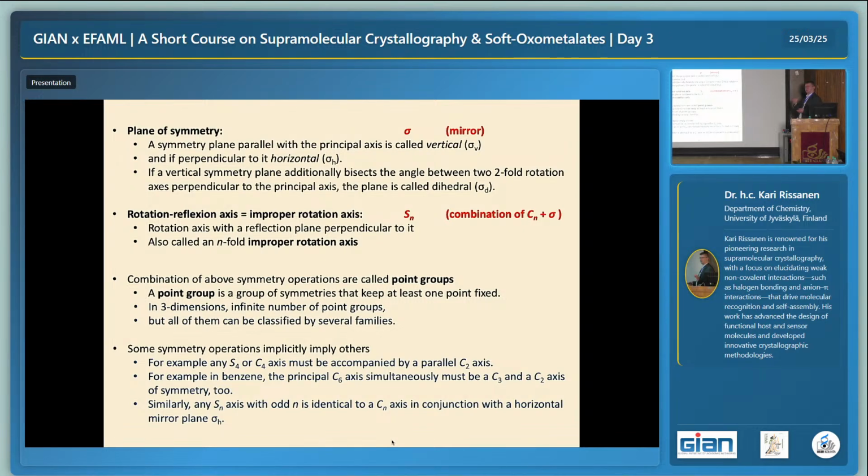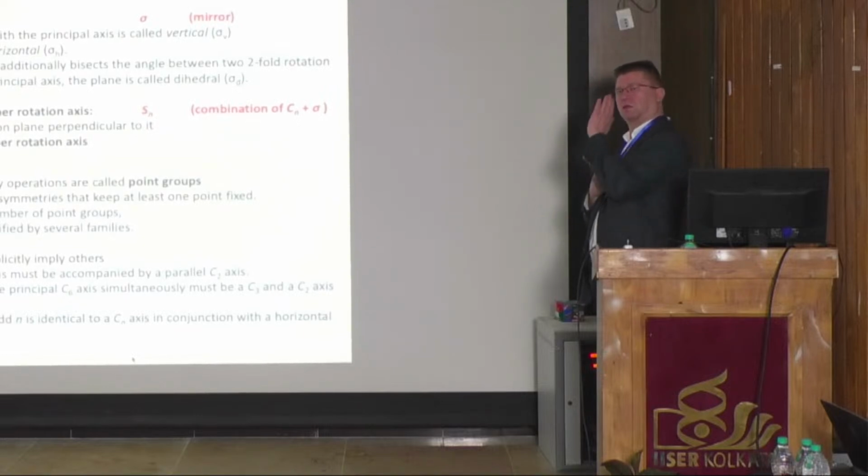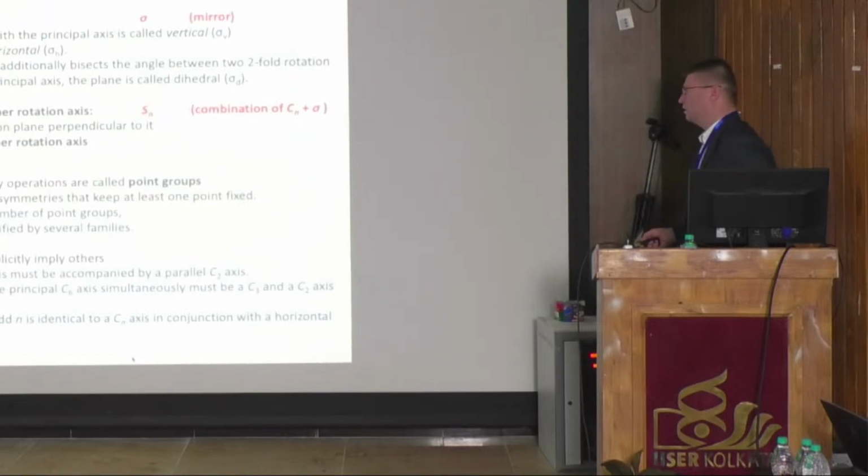And you will see this also when I show you the programs. It's sometimes surprising when you see a molecule that looks like only one half. And you ask, where is the other half? For example, you can see half a benzene ring in your structure in the beginning. So what is going on? There can't be half a benzene ring. But the other half comes from symmetry, and the program doesn't show you the symmetry. It just shows you the 3 atoms. It's lying, for example, in a mirror plane, so it just sees certain atoms, and the rest comes from symmetry. So that's the simple idea.